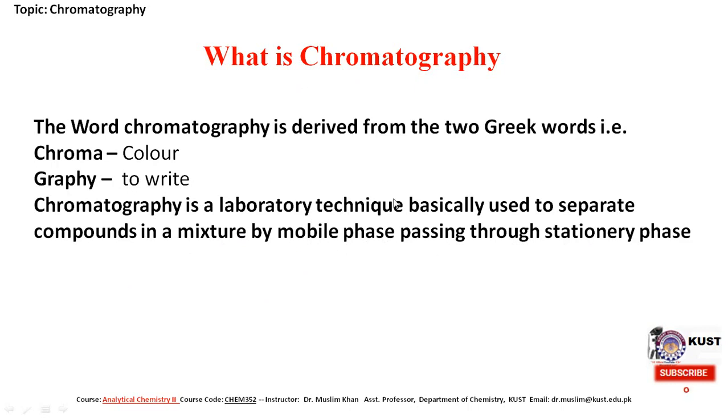So chromatography literally means color writing. It was named in the first decade of the 20th century, primarily for the separation of plant pigments such as chlorophyll.